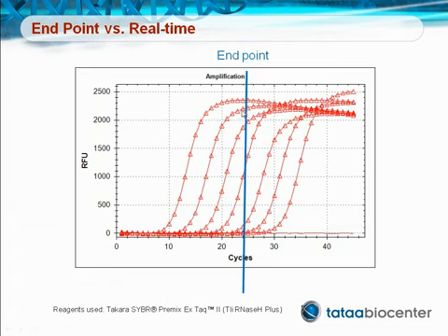Clearly, comparing PCR amplified samples after a fixed number of cycles, the dynamic range is limited.